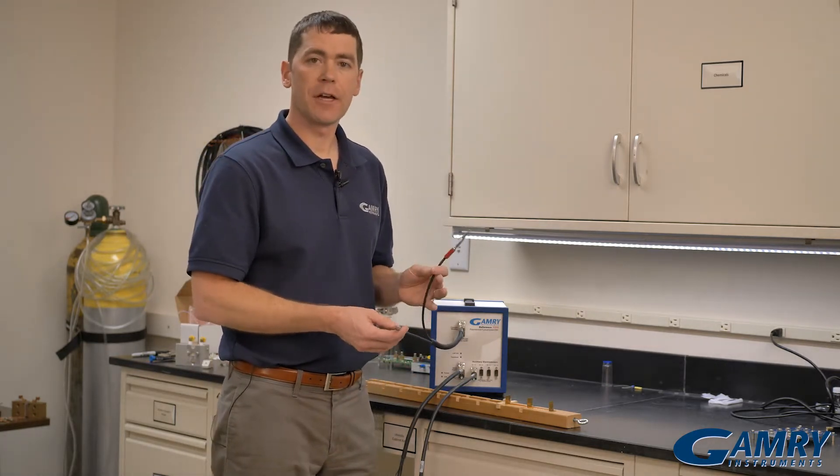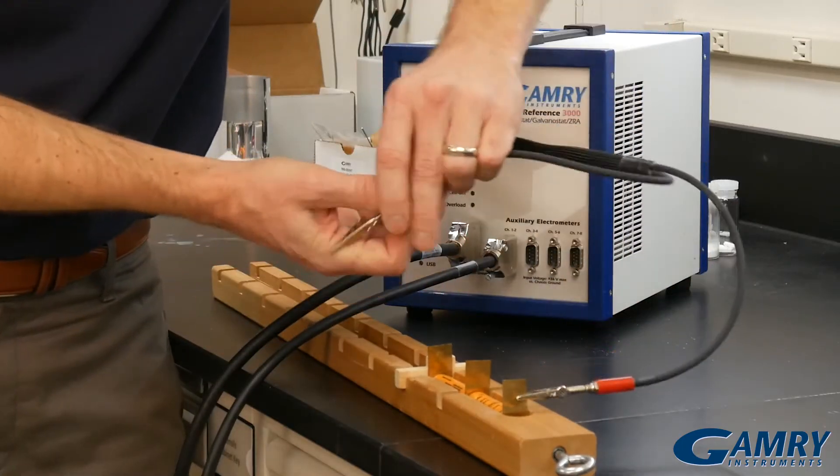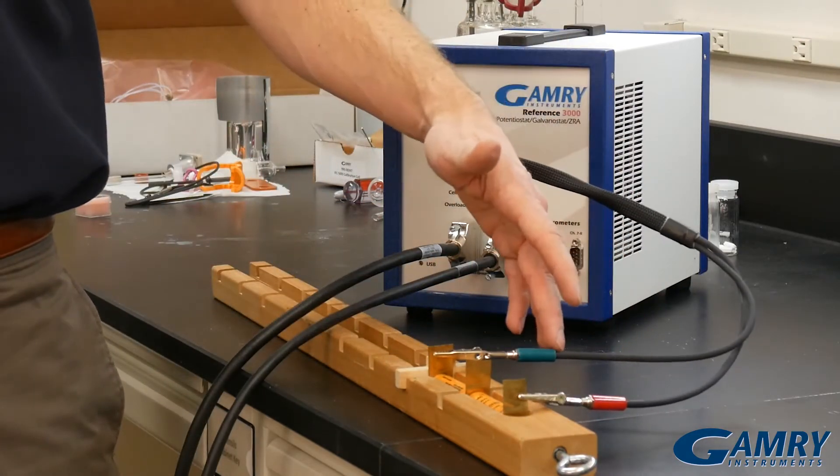First I'm going to take my current-carrying leads and connect them to both ends of the stack. I've connected my counter and my working leads to the negative and positive ends of the stack.